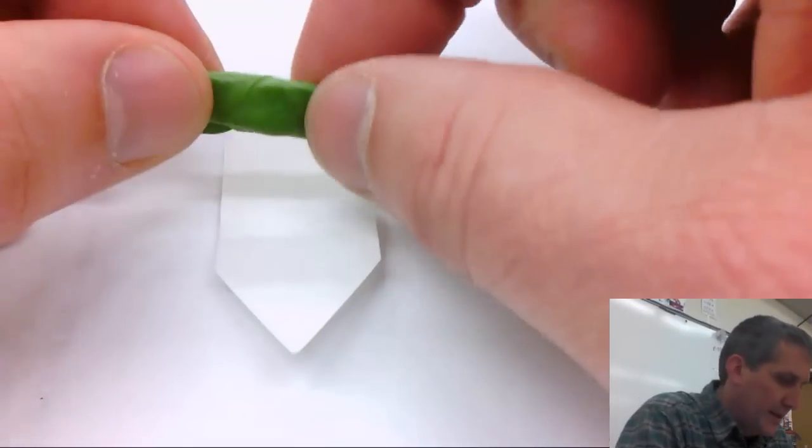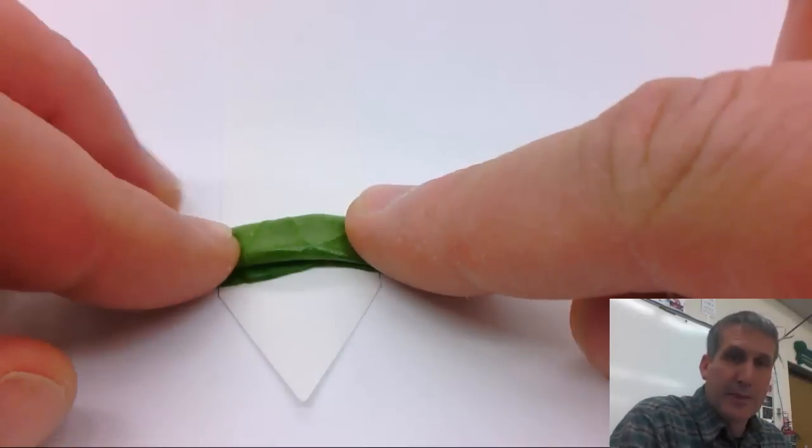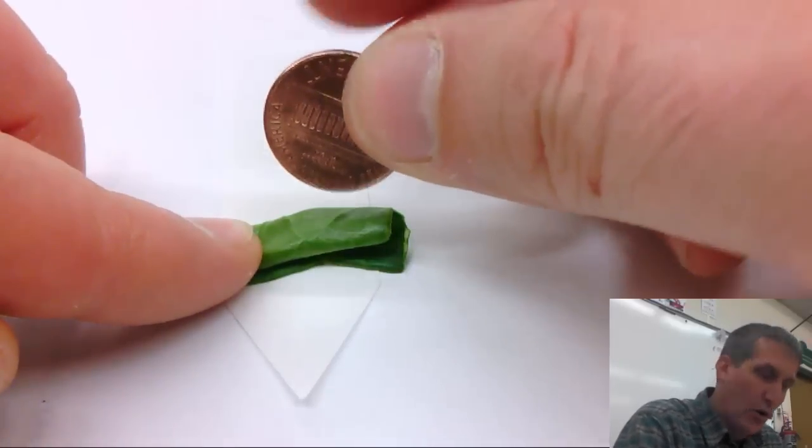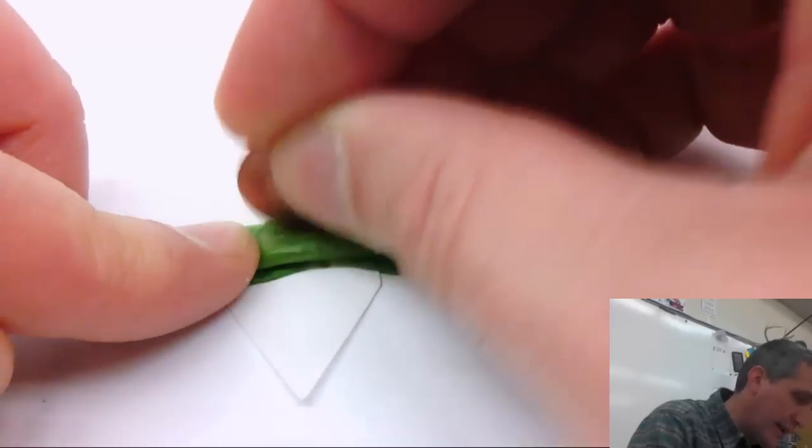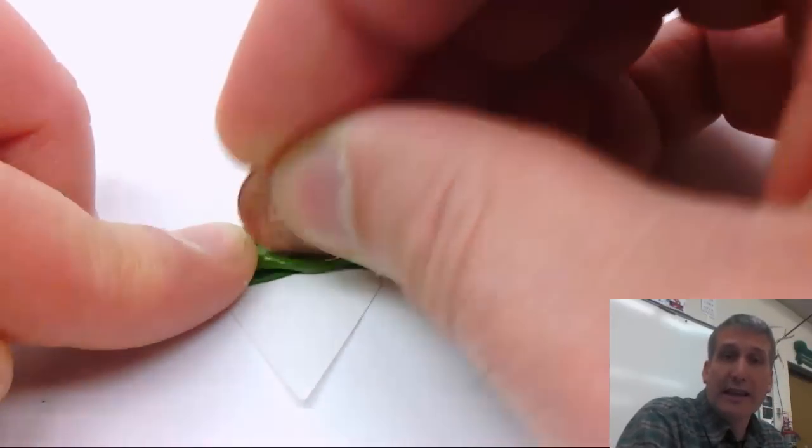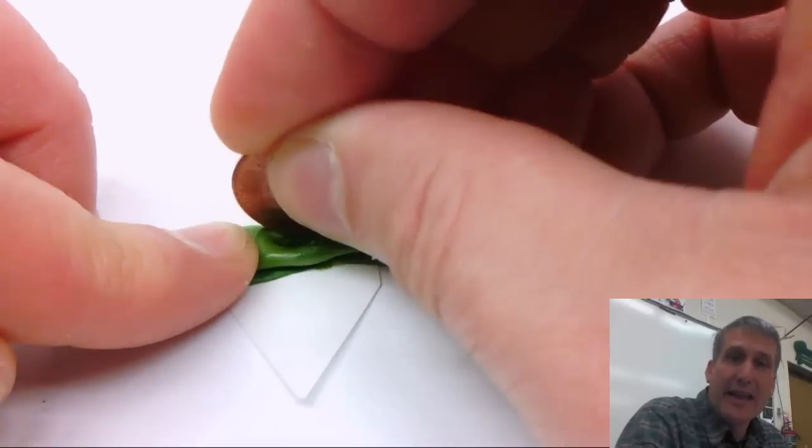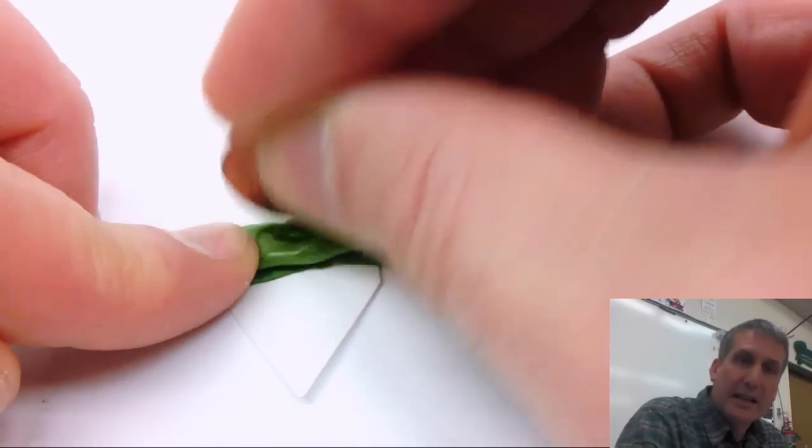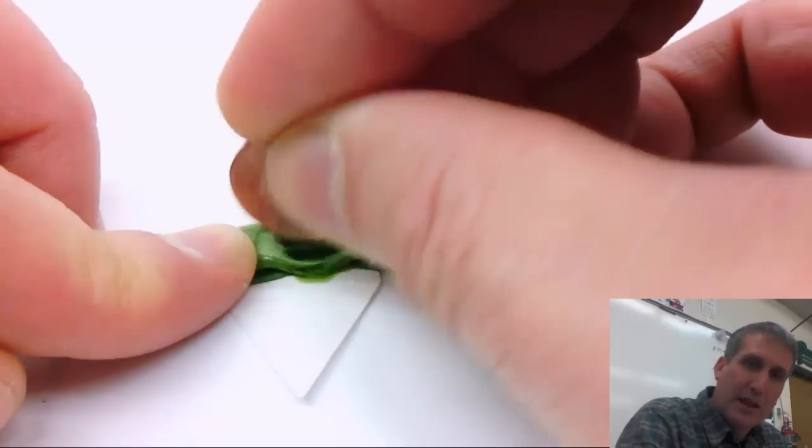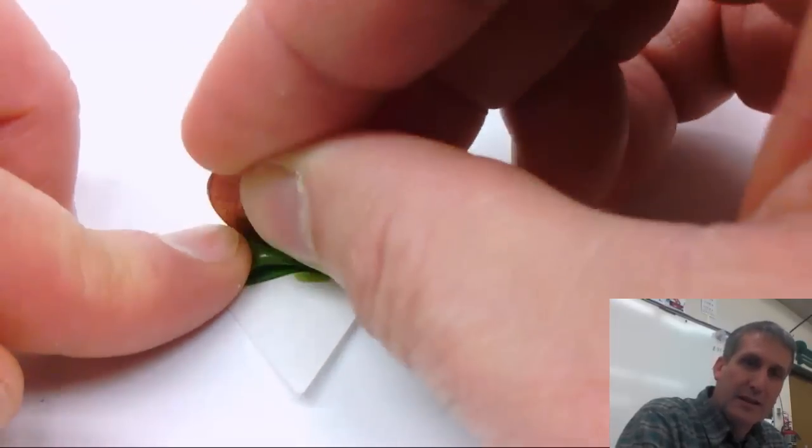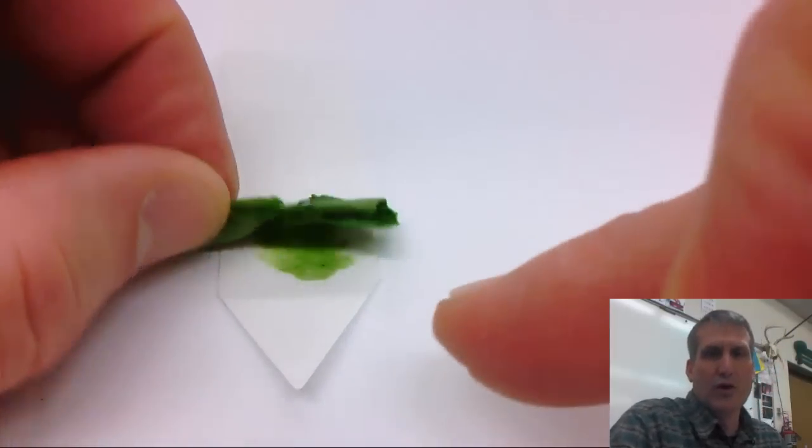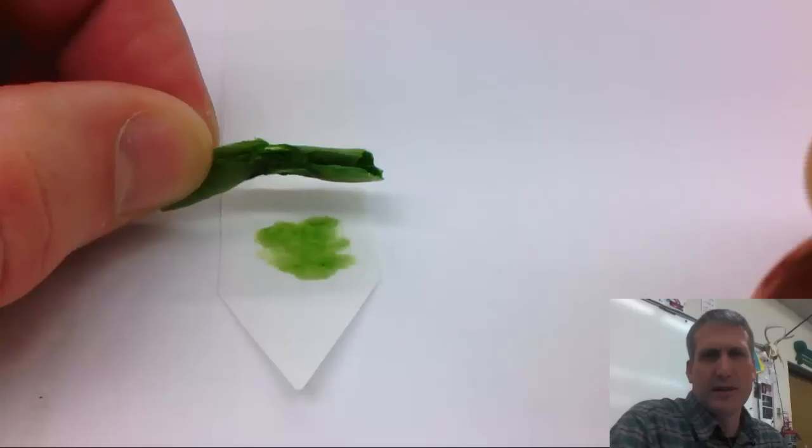So what I do is I put the piece of spinach down above the point and I take a coin and I press that coin so that I crush the tissue of the leaf. In that way I'm releasing the pigments that are trapped in the chloroplast and they are being absorbed into the liquids of the leaf and then ending up being absorbed into the chromatography paper.